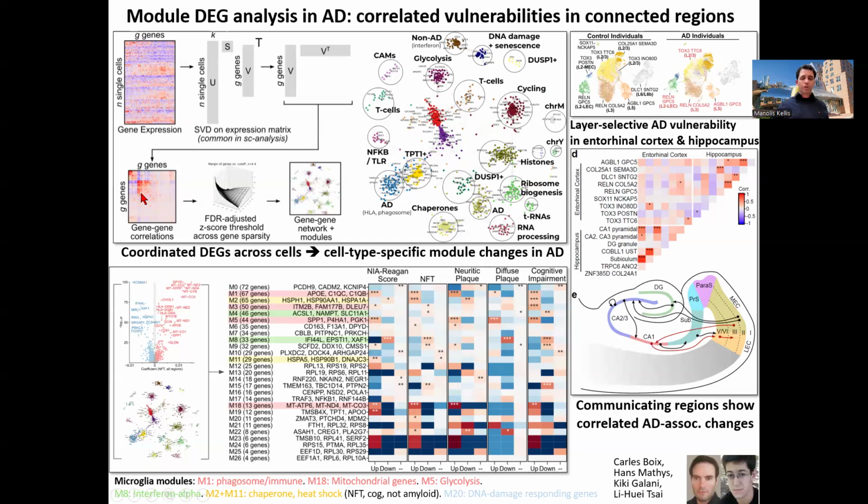You can take this matrix and look at just clusters, or you can take this matrix and ask what the correlation is between every pair of genes. The strength of that correlation between every pair of genes can give you modules of genes. It gives you a network of genes. Therefore, now you can visualize every single gene, not just whether it's in a cluster or not, but where it is connected in that network of gene-gene correlations, if you wish. Is everybody with me here?